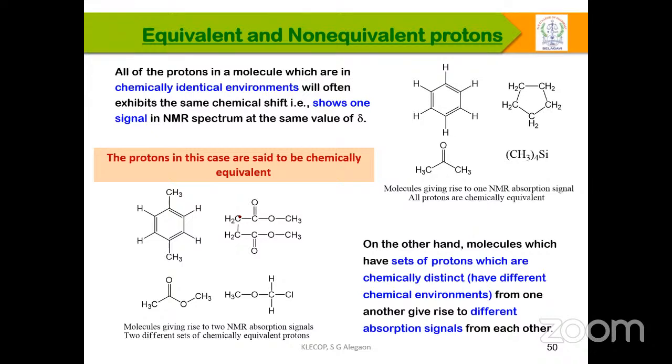One should know, before going into structural elucidation, that you can write a probable structure. From the probable structure, one should understand how many types of protons are available, what the characteristic of each proton is, and whether these protons are assignable. Sometimes aromatic protons more or less merge with one another. Then you have to see whether there are any assignable functional group peaks which can confirm that the compound is what you expected.